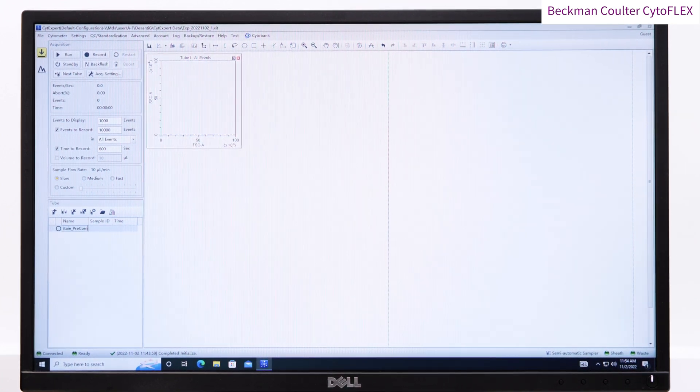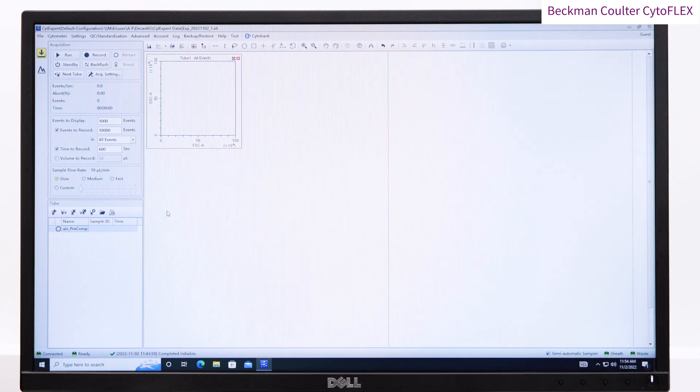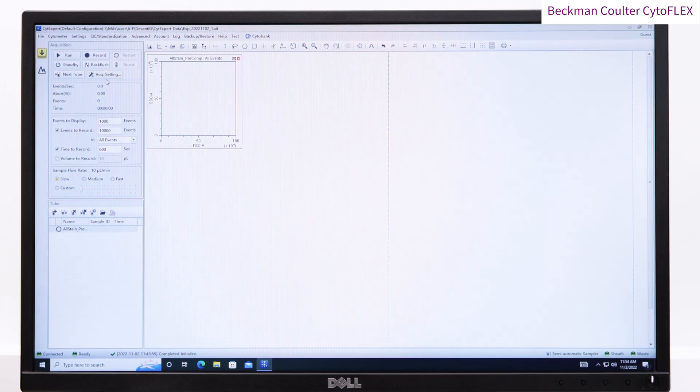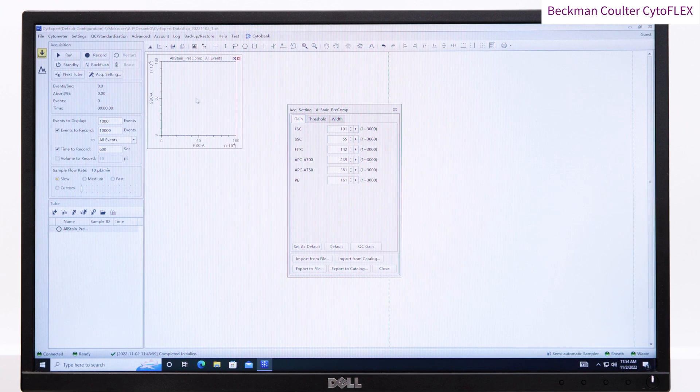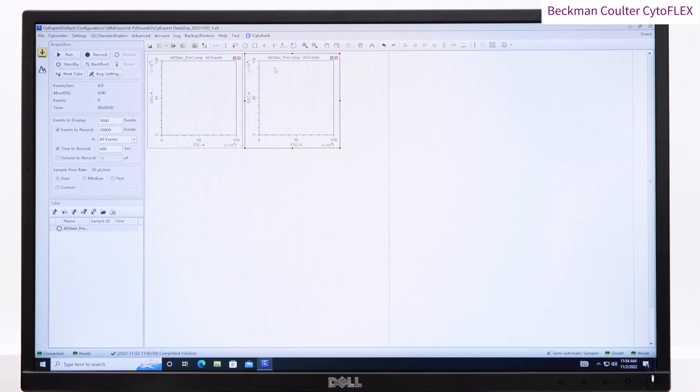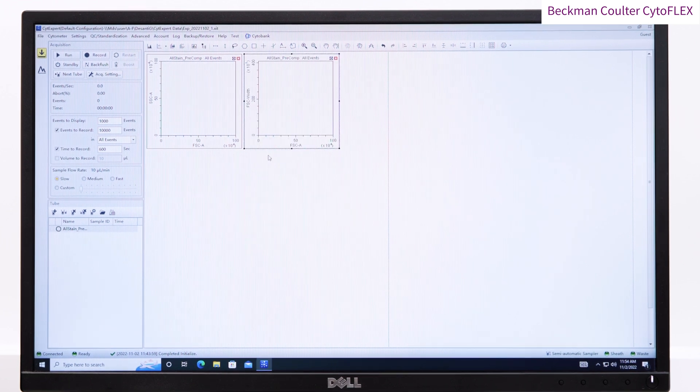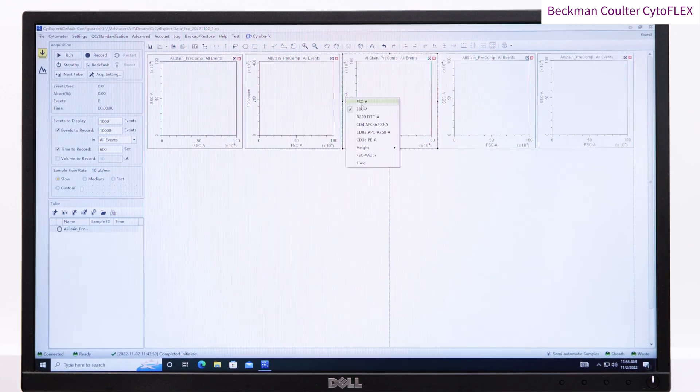Name the first sample and check the acquisition settings. You may have some gain settings you wish to import. If not, start from the default gains. Create the required dot plots and histograms for your analysis.